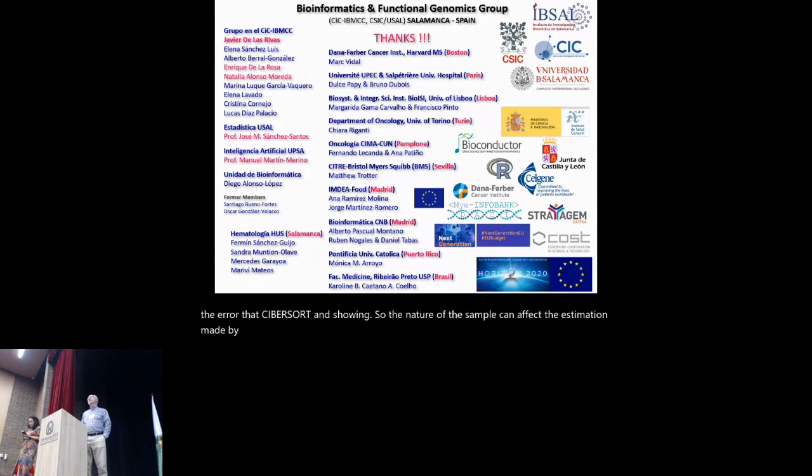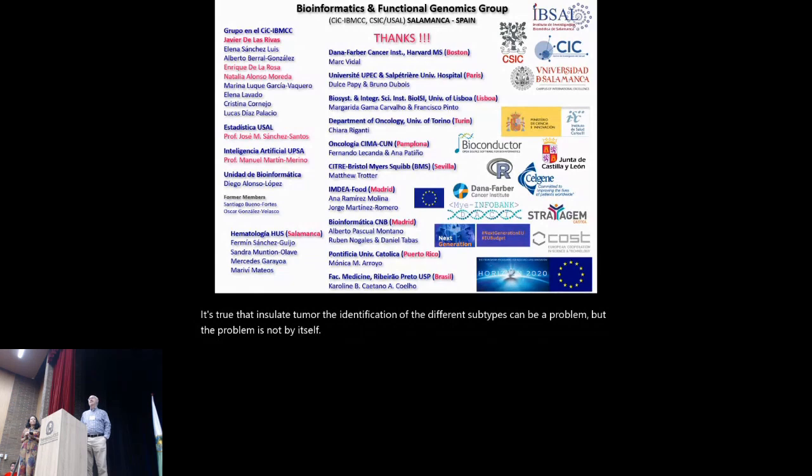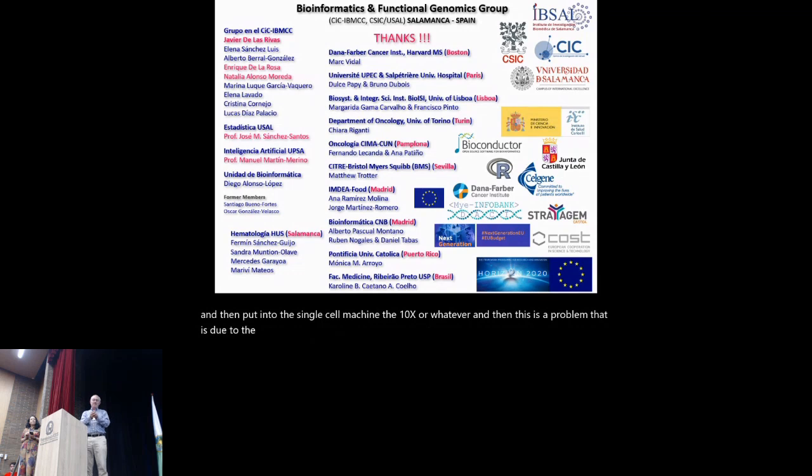Well, this is a good question. Yes, it's true. We work a lot for this work with hematologists and in cancer, hematological cancer. So this is liquid, not solid tumors. It's true that in solid tumors, the identification of the different subtypes can be a problem, but the problem is not that by itself. The main problem is in the processing of the sample, because you have to detach the cells and then put them into the single-cell machine, the 10X or whatever, and this is a problem that is due to the separation of the cells.